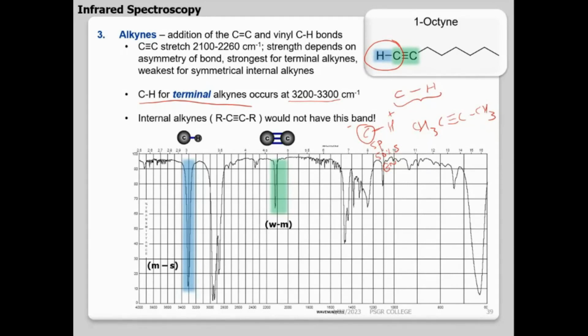But the values we see here will depend mainly upon two things. One is the dipole moment. A higher oscillating dipole gives a higher electromagnetic field. So this will have a very high oscillating dipole, a very high dipole moment, so it will have a very high electromagnetic field. One second guys, one second.